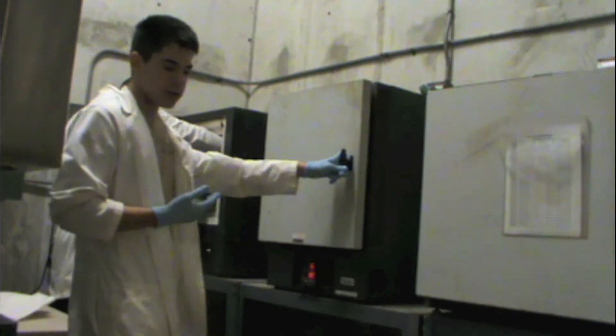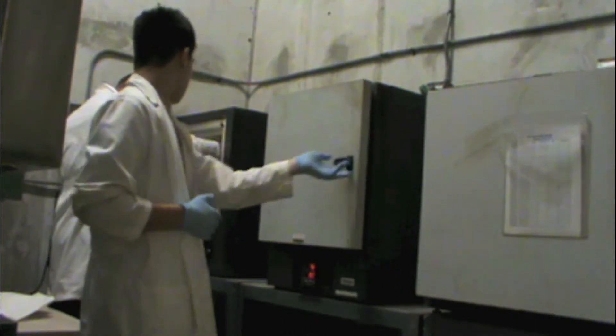Martin right now is putting these samples in the oven, so I'll take the camera over here to show what the inside of the oven looks like.